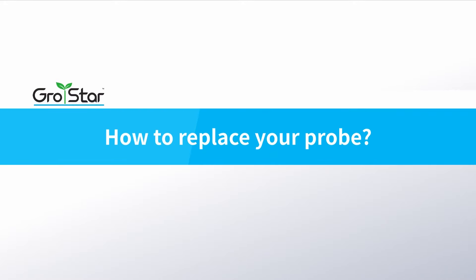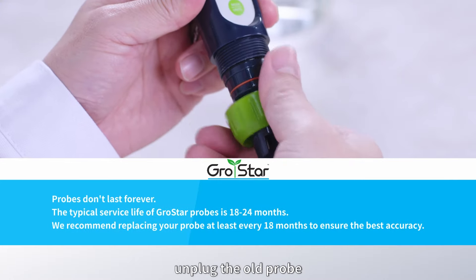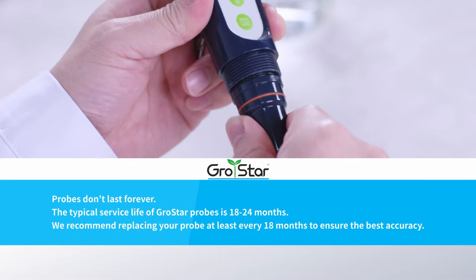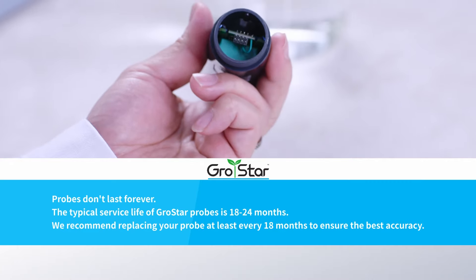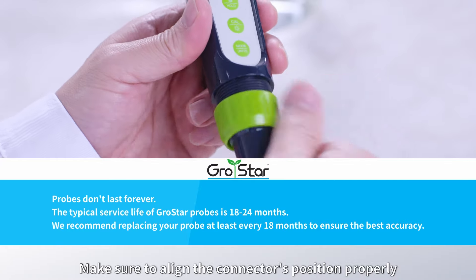How to replace your probe. Screw off the probe ring. Unplug the old probe. Plug in the new probe. Make sure to align the connector's position properly, and screw on the probe ring.